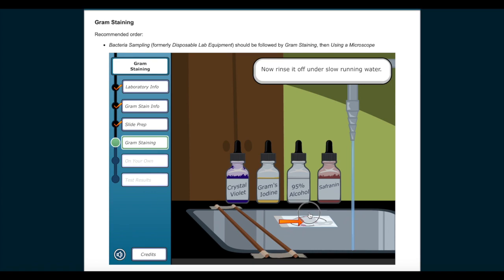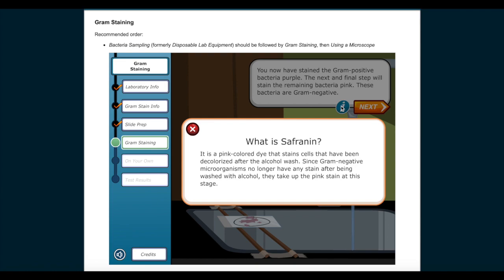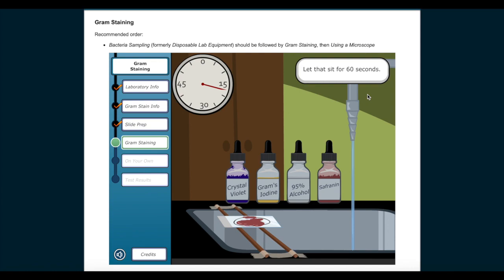You now have stained the gram-positive bacteria purple. The next and final step will stain the remaining bacteria pink. These bacteria are gram-negative. What is safranine? It is a pink colored dye that stains cells that have been decolorized after the alcohol wash. Since gram-negative microorganisms no longer have any stain after being washed with alcohol, they take up the pink stain at this stage. Use the dropper to cover the slide with safranine. Let that sit for 60 seconds. Now rinse it under slow running water.